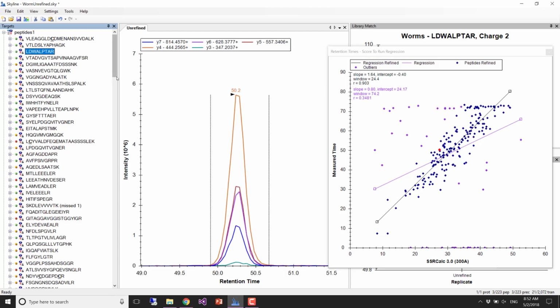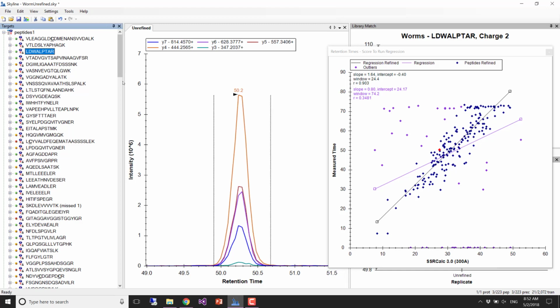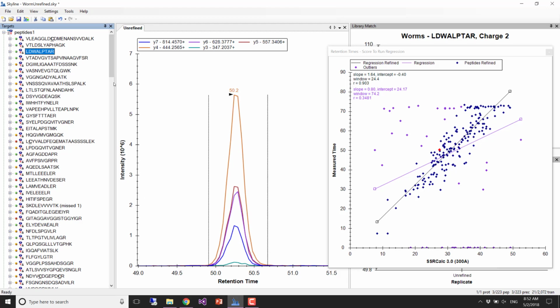Okay, but yes, this is the way we did it. We were just like, well, can you do targeted proteomics sort of brute force? Because when we started, we were working with CPTAC, and they were just ordering synthetic peptides and synthetic proteins for everything. And we were like, well, can we get some? We're a poorer lab. We don't have the money to order quite as many synthetic isotope labeled peptides. Can we get an idea of what we think is measurable before we start ordering peptides?